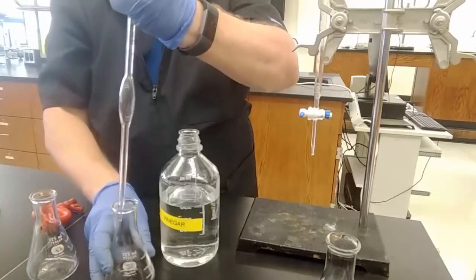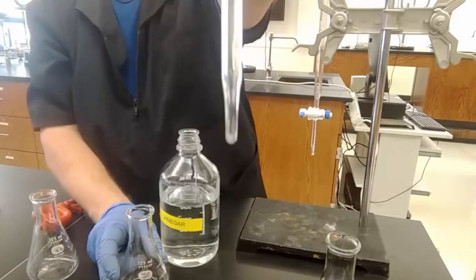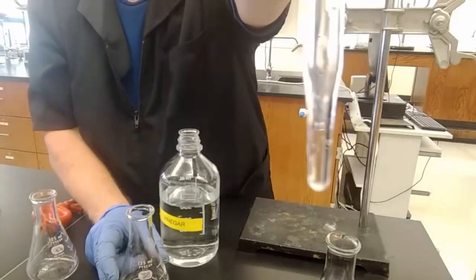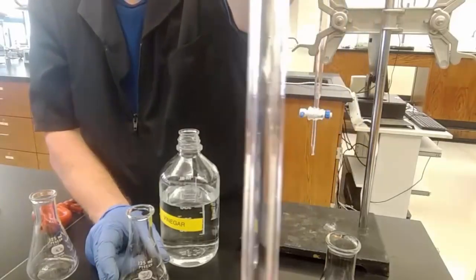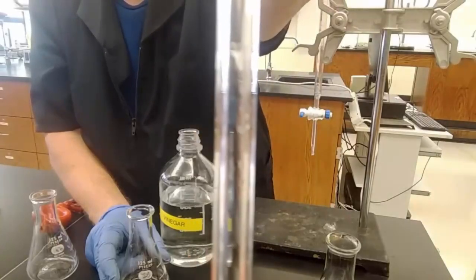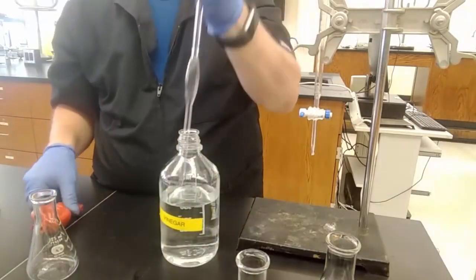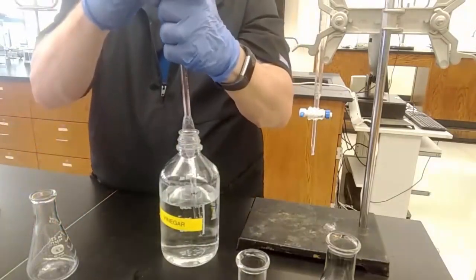Drained on its own. I touch it to the side, get that last drop off the tip. But again, there is a little bit in the tip that is calibrated for and designed for. There are, again, drops inside the neck, not calibrated for, not supposed to happen. That's two of three. Three of three.